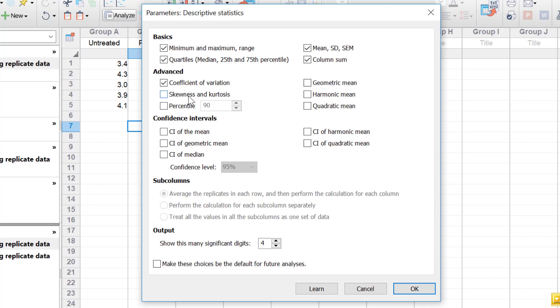There's also skewness and kurtosis. Skewness measures the lack of symmetry in the data distribution, and kurtosis measures whether the data are heavy-tailed relative to a normal distribution — in other words, are there likely to be outliers in your sample? Additionally, there's an option to select your own percentile, so instead of just the 25th and 75th percentile, you can change the value to return whatever percentile you'd like, for example the 90th percentile, which returns the 10th and 90th percentiles.